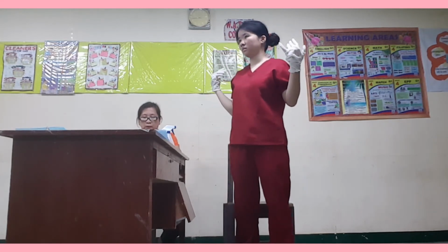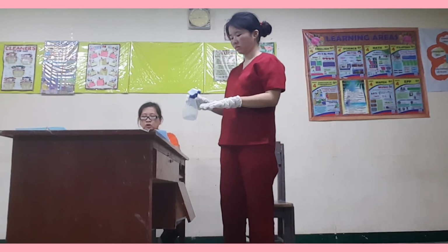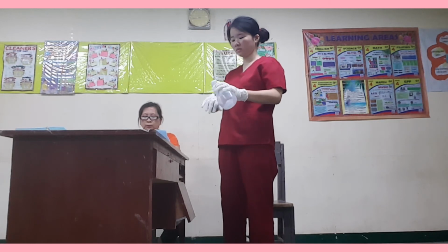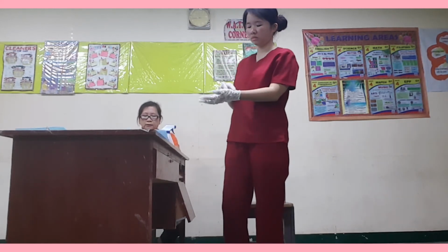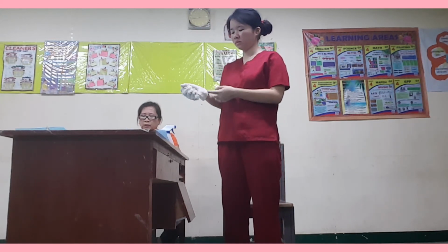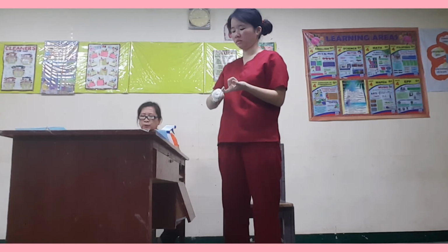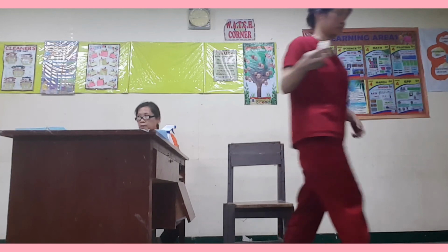Procedure number 20. Disinfect and remove the gloves. Use a 1:10 bleach disinfectant or alcohol-based hand rub (ABHR). Discard the gloves to reduce transmission of microorganisms among medical workers, and discard the used gloves into the proper waste container.